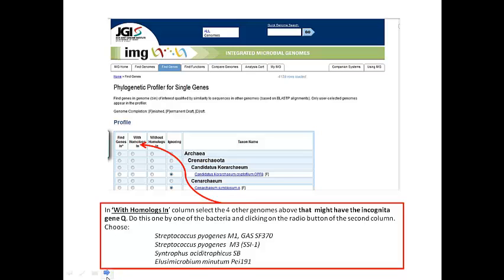You have to put it in Control F. Oh, thank you. Command F, and then you can put it. And I would put just the strain name, gas, or whatever, because you're going to find them easily. Yeah. They've just sequenced 200 strains since we did the tutorial. That's the only problem. They've just added a whole lot of new M1 gases. I don't think it matters which one. I did this at the weekend and it worked with the one I picked. So remember, these you're now clicking off in the second column. So has everybody now put 4 genomes in the second column?